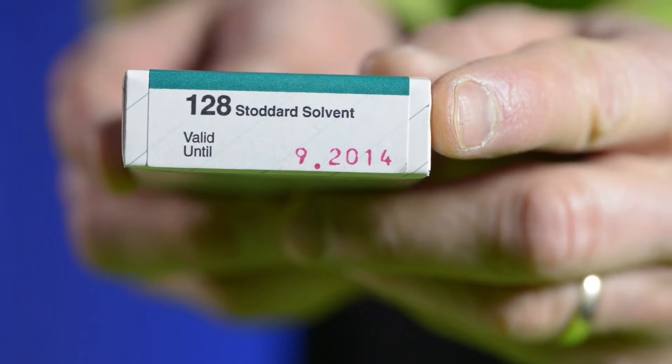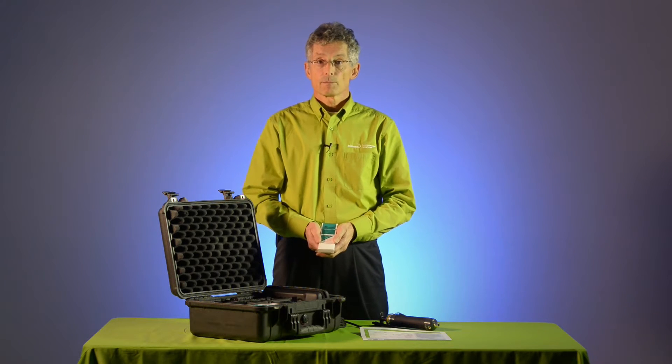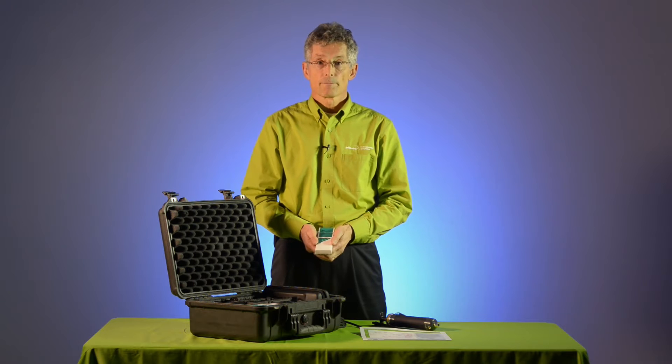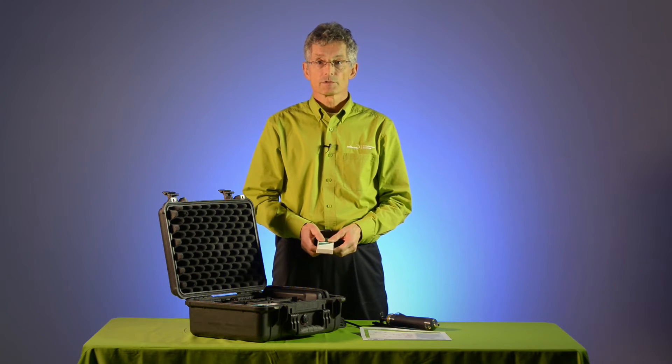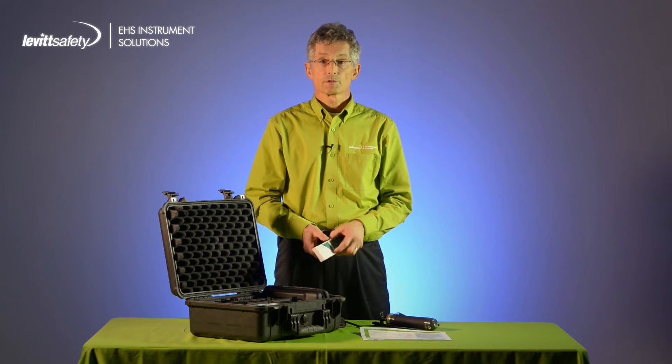Portable gas detectors measure a limited selection of inorganic gases such as oxygen, carbon monoxide, and hydrogen sulfide. Organic gases such as solvents, thinners, and fuels cannot easily be detected by other portable instruments.